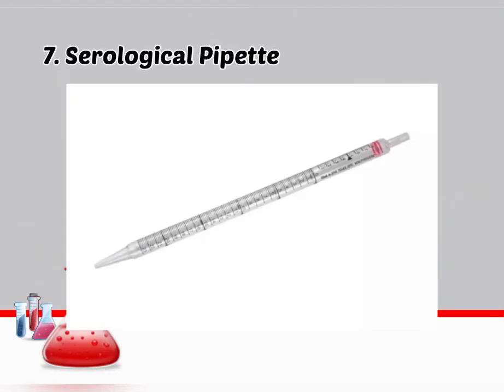We also have the serological pipette. The serological pipette is a laboratory instrument that transfers liquids measured in volume by mL. Most have graduations on the side for measuring the liquid being dispensed or aspirated. The use of serological pipettes is an efficient and gentle means of mixing cell suspensions.